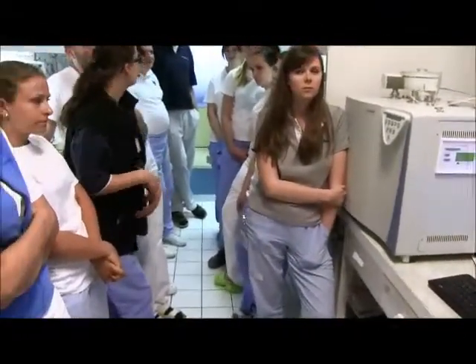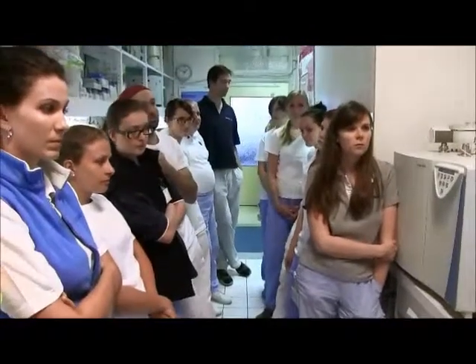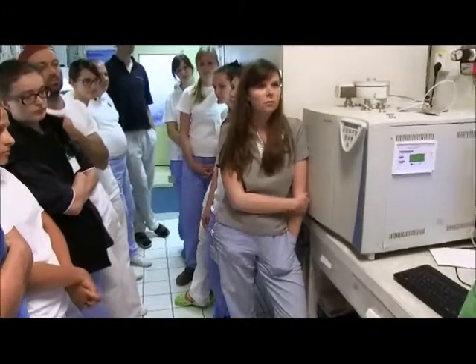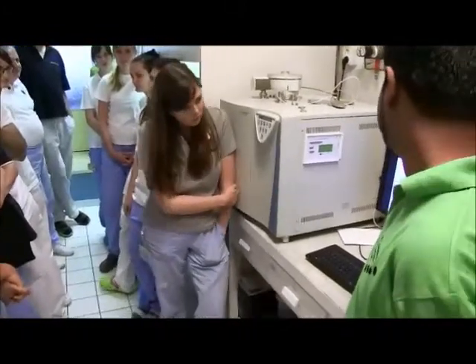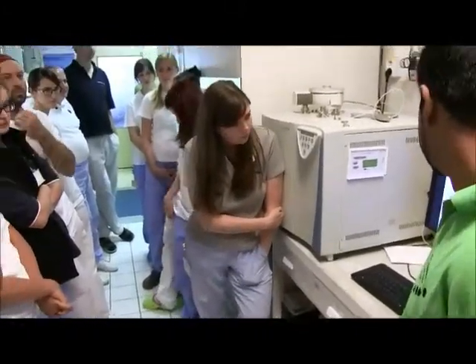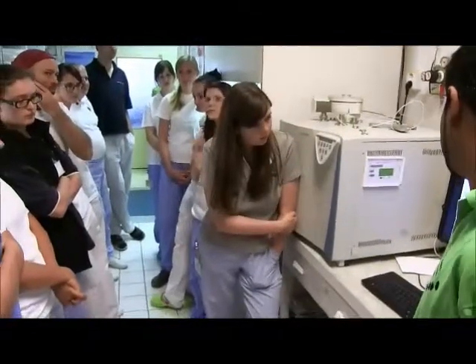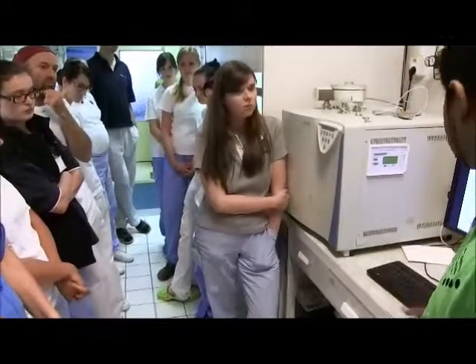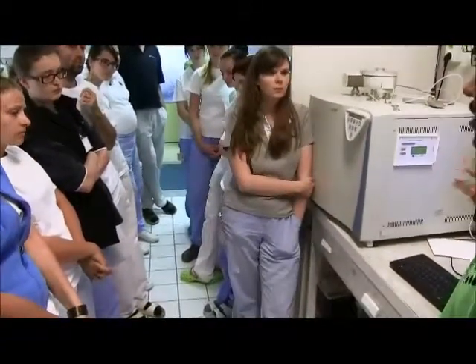So generally we use 120, and it depends. Sometimes it varies slightly. For example, we really want to prepare yellow, but sometimes at 90 degrees it shows a greenish yellow. Sometimes it depends on the environment, a little bit, plus or minus 5.